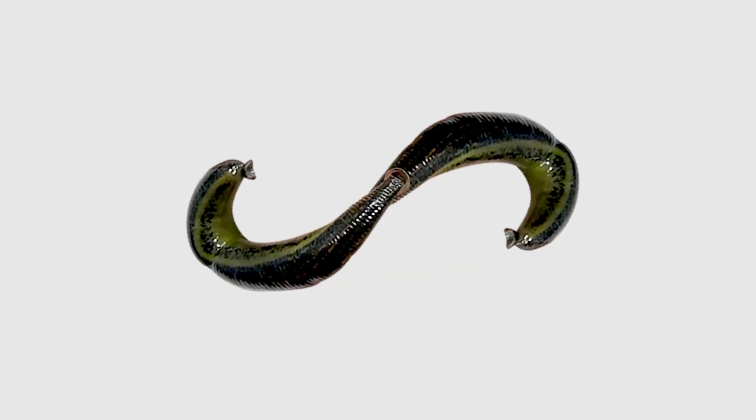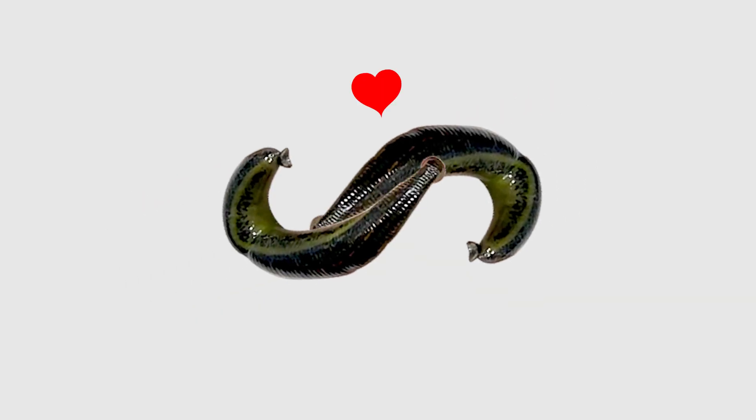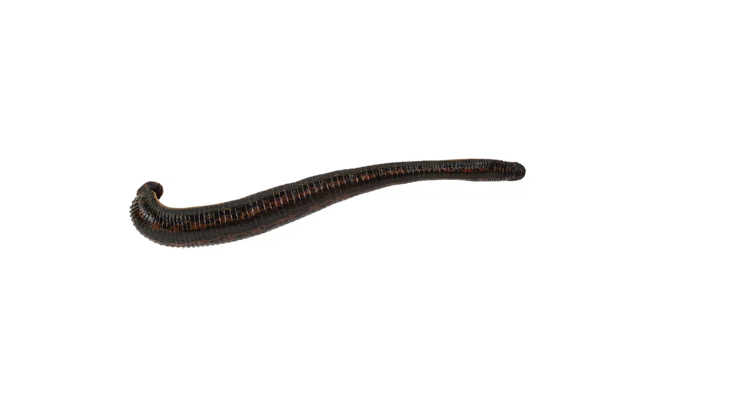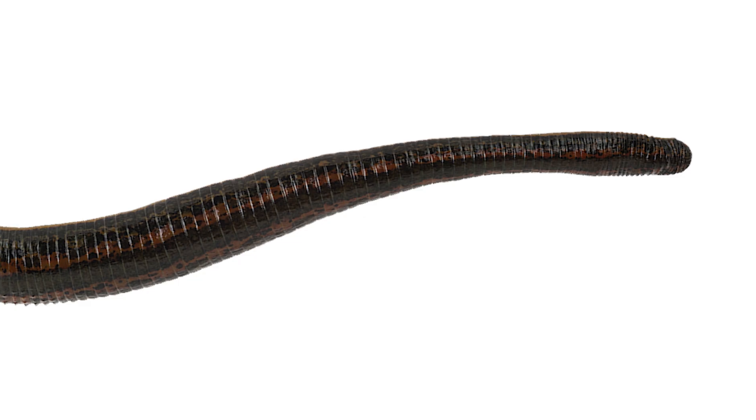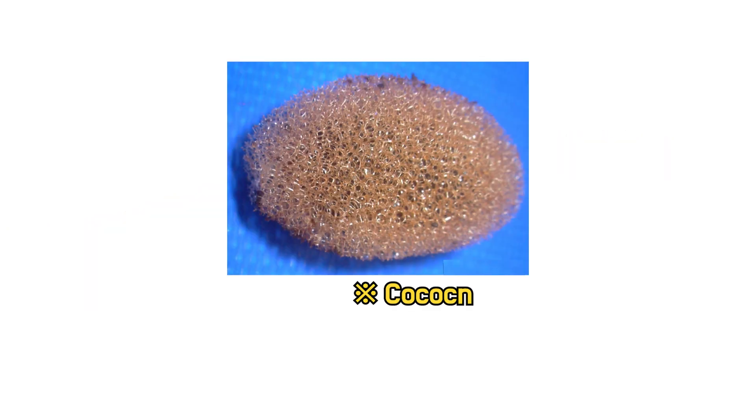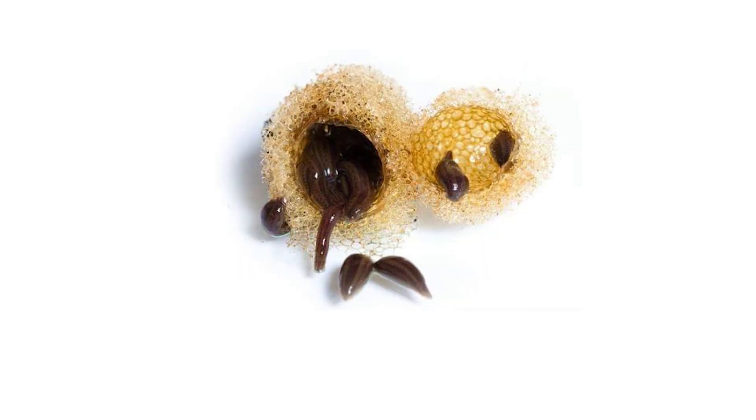They engage in mating by aligning their bodies and injecting sperm into each other. They store the sperm received from another individual, and when the time comes to lay eggs, they internally fertilize and create a cocoon, within which they lay multiple eggs. Larvae are born inside the cocoon.